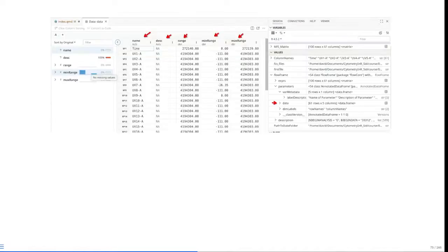And in this case, when we click on it, we can see that what we actually saw within that initial read FCS output is what we're seeing within this particular object. So if we're trying to get the actual things that we're seeing displayed on the console, we need to extract this particular one. Now, name is kind of intuitive. We know it's the detectors that we're interested in. The description is blank right now, but this is raw spectral flow cytometry data. If you're working with a conventional flow cytometry file or an unmixed spectral flow cytometry file, your actual marker of interest would appear within this description column. And then range, min, and max range we'll talk about later. They're not particularly important for what we need to worry about today.